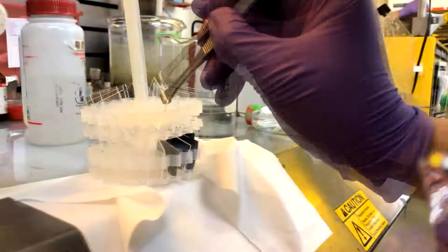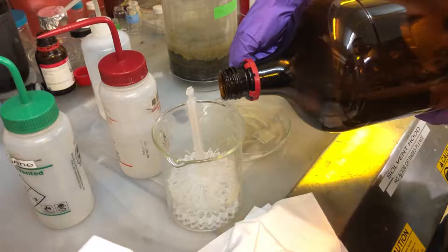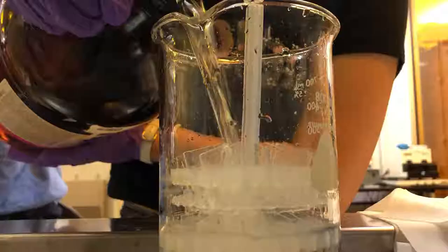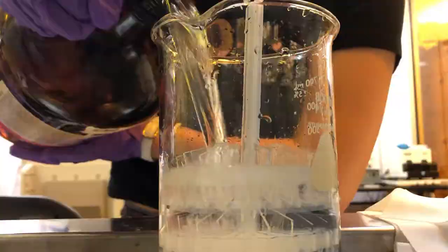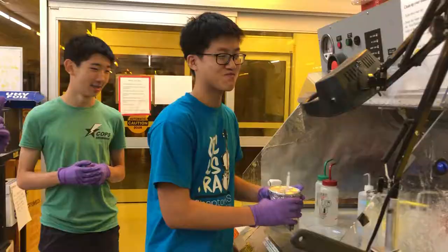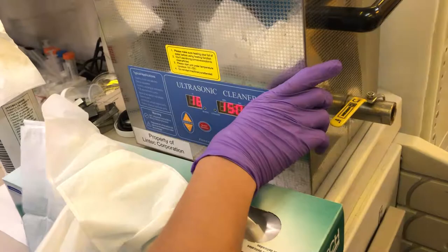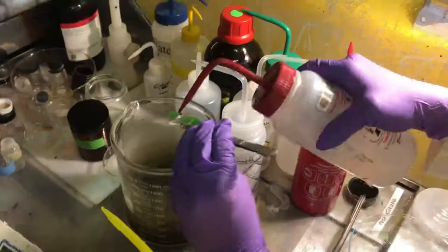The cleaning procedure involved placing the cut substrates into a beaker, covering them with various solutions, and then placing them into the ultrasonic cleanser for 15 minutes. Nice work, Andrew. Thanks, Annie.